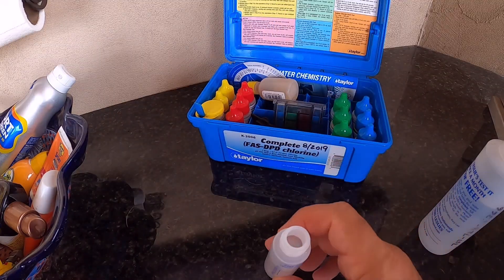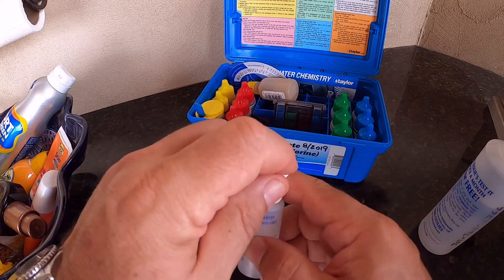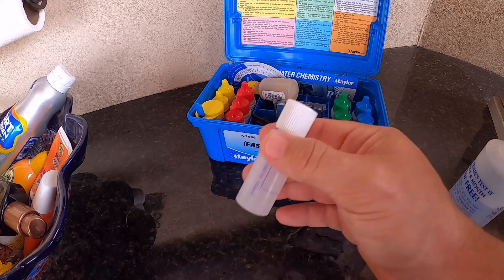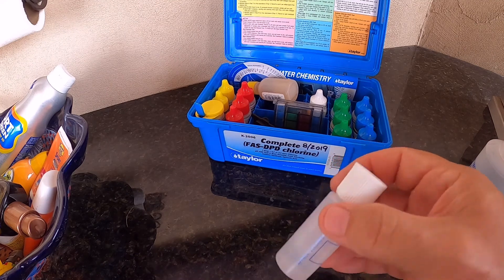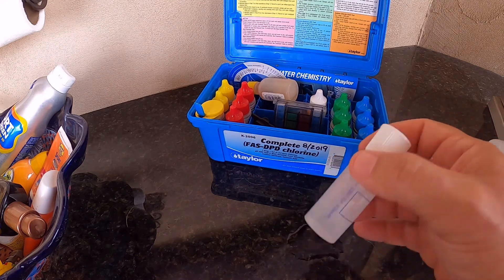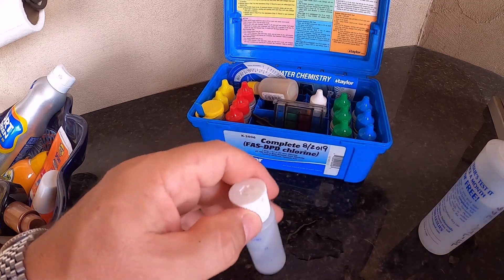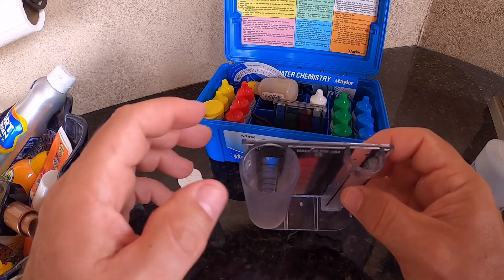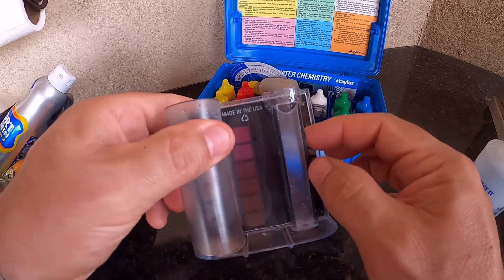When you have that done, put the cap on and shake it up for 30 seconds. Then we're going to take this solution and pour it into this small tube here.